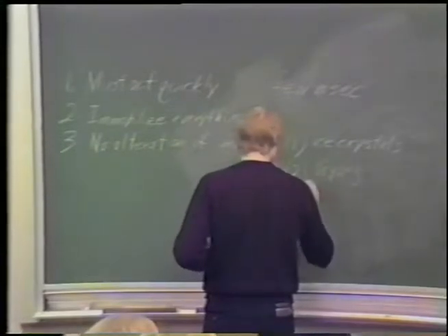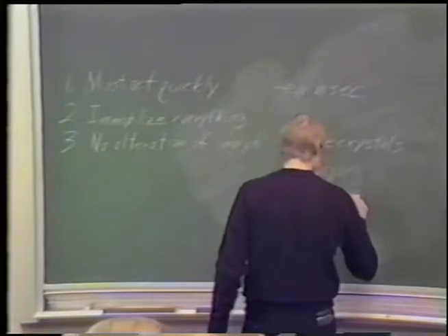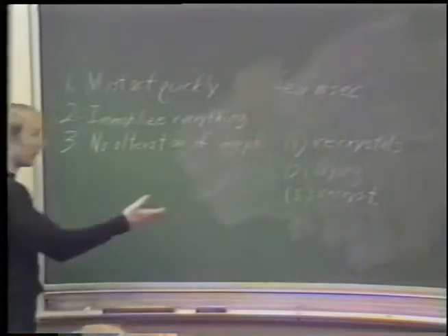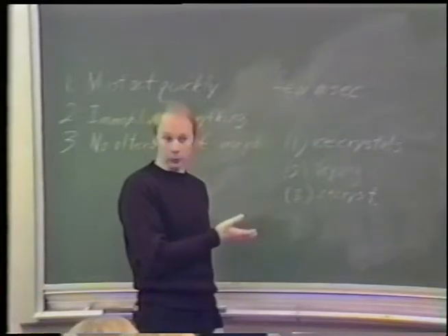Okay? The third artifact is recrystallization of the ice in the ultra-rapidly frozen sample. And again, this is easy to recognize, as the ice crystals, and it's easy to avoid. You just keep it cold.